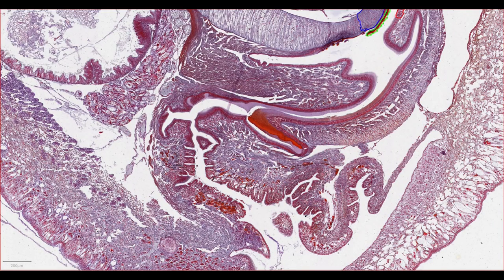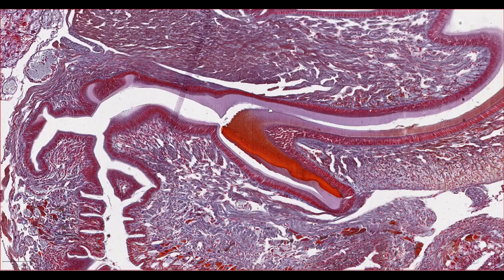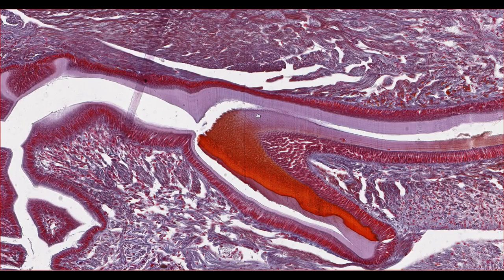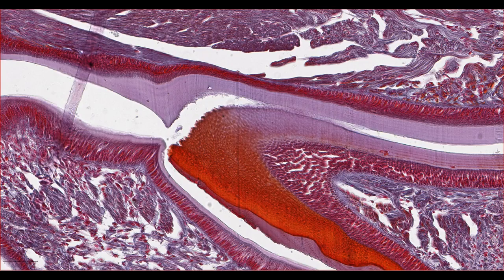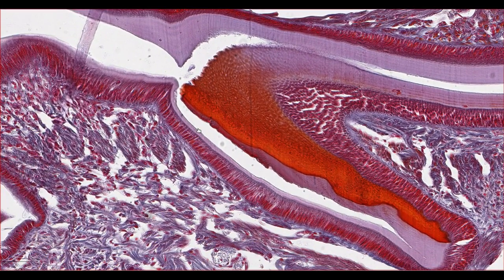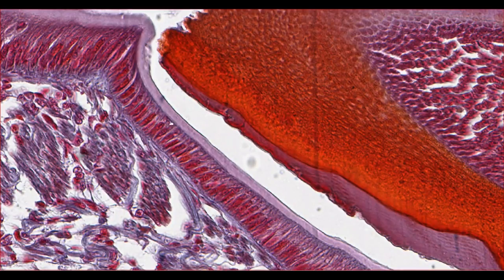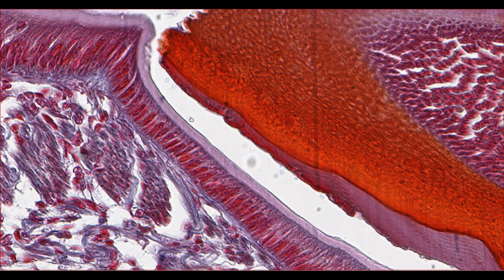Just over here, we can see the entrance to the snail's mouth. If we zoom in, we can appreciate a laminated layer of acellular material sitting on top of some very columnar-looking cells. Just down here is the acellular layer, and here are the very columnar-looking cells. This is the oral cavity, with the acellular material presumably there to protect the snail's soft tissue from the tough, fibrous plant material it's eating.